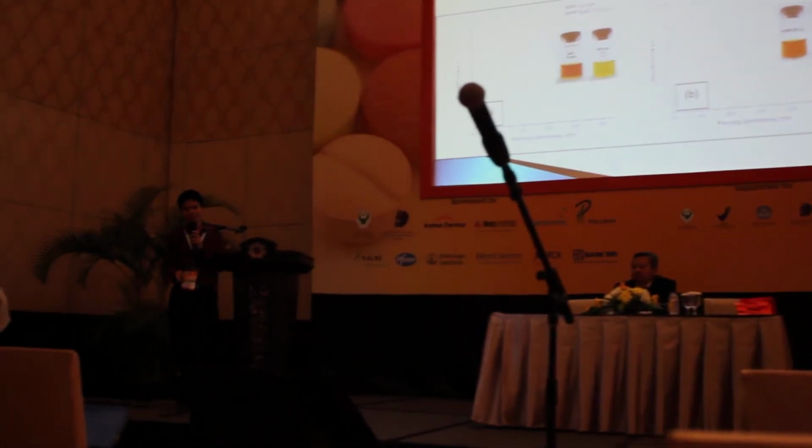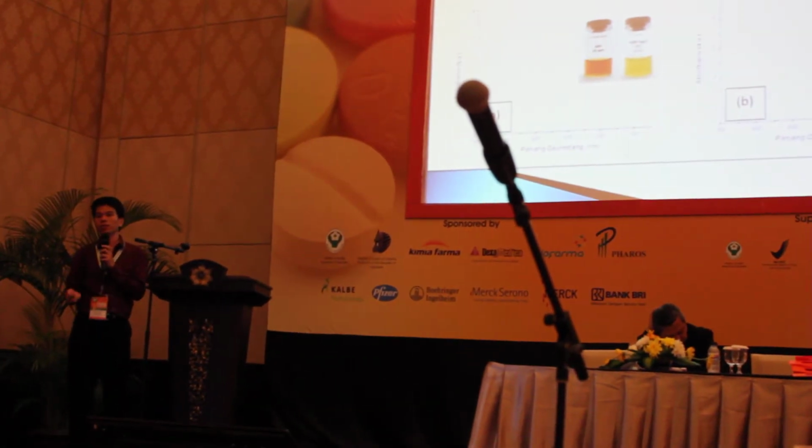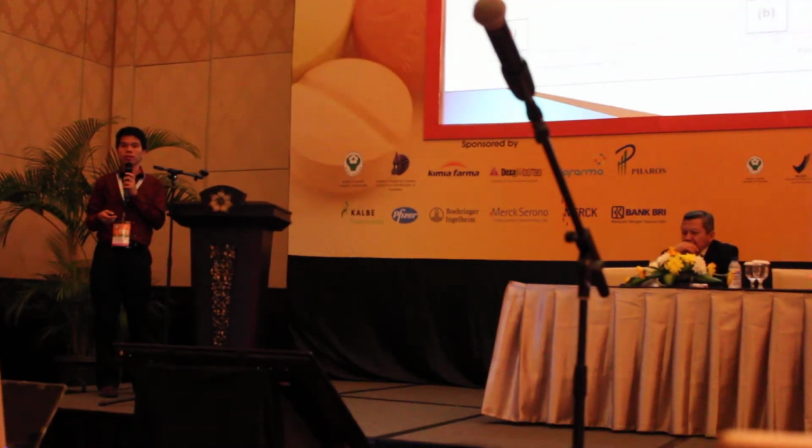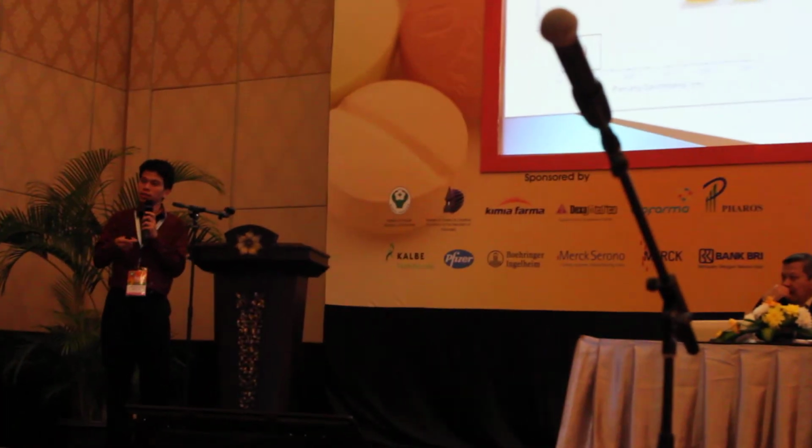Okay. With sodium chloride 1 molar, it will decrease the absorbance of the nanosilver without polyvinyl alcohol. But with nanosilver that has been modified by polyvinyl alcohol, the absorbance decreases not a lot. So sodium chloride can decrease the stability of nanosilver, but at the same time it increases the sensitivity of the indicator.